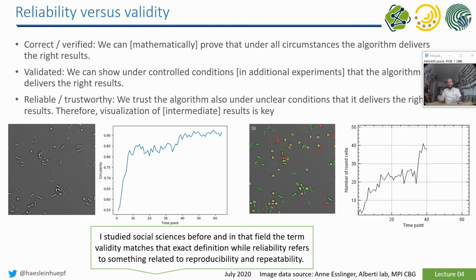I developed a workflow from a theoretical point. The algorithm does the right thing. It was proven under different conditions that this algorithm is good. But when I apply it to my data, I have to do some additional effort in order to make it reliable, in order to gain trust in what I'm doing here. And visualization is, from my point of view, the key in order to do this.